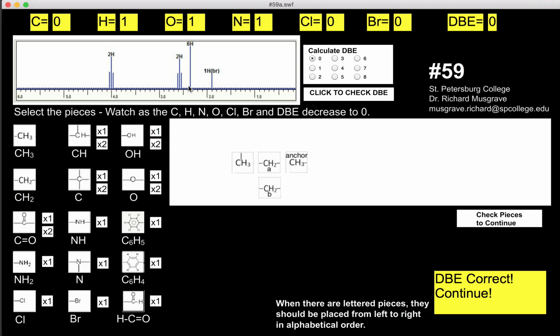There's one other clue that I can look at here, and that's with the CH2 group, and that's at 4 ppm, indicating that's directly connected to an oxygen. Now there's nothing else in that region, so there can't be two carbons connected to the oxygen, which again leads me to be thinking that this 1H might be an OH and that the OH is connected to the CH2. So let's see how that will go.